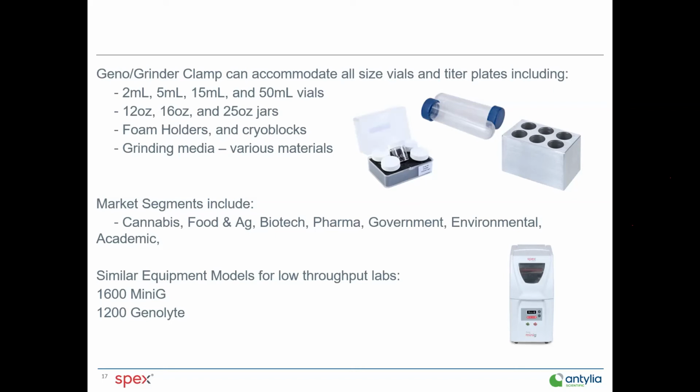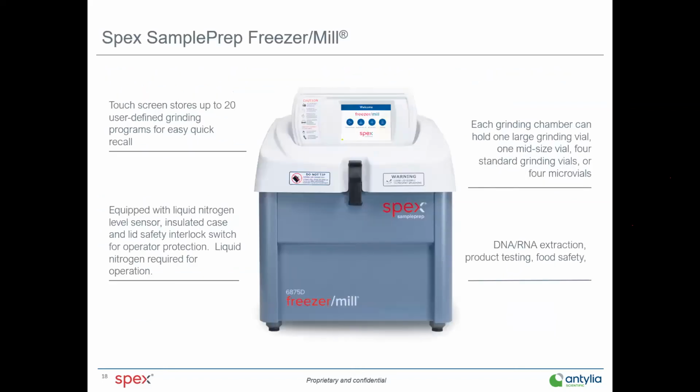And then the next unit is designed specifically for edibles. This is probably, for me, one of the most fun instruments that we have, because you never know what you're going to be asked to grind, and this unit will pretty much grind it. Anything that will not grind at ambient temperatures, for example the cookies, the gummy bears, we can grind. A batch of gummy bears takes about 45 seconds in the freezer mill.